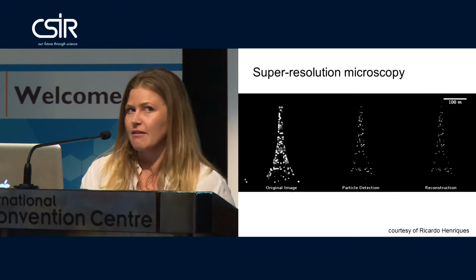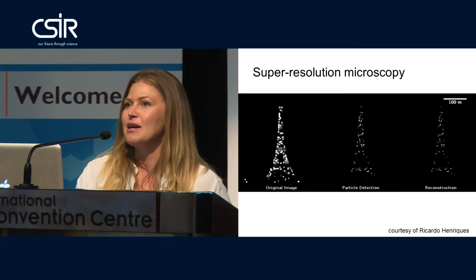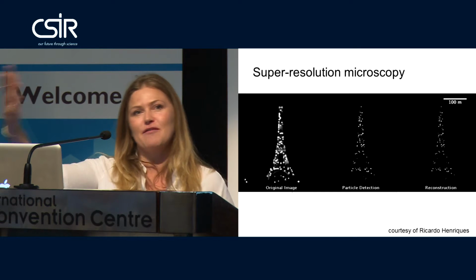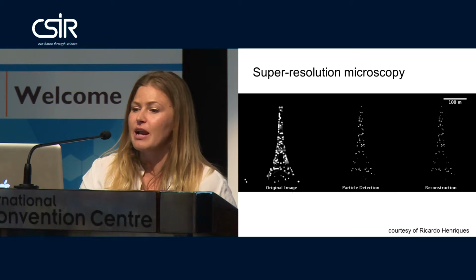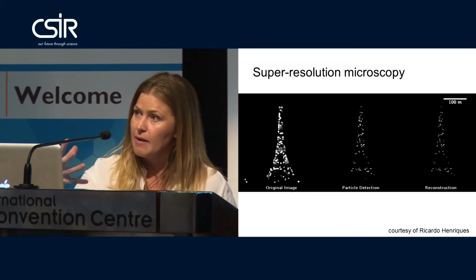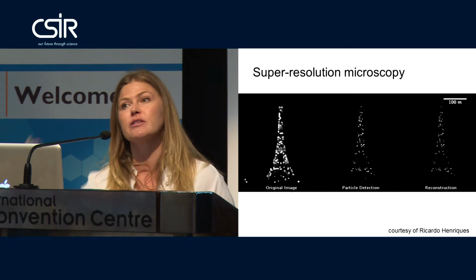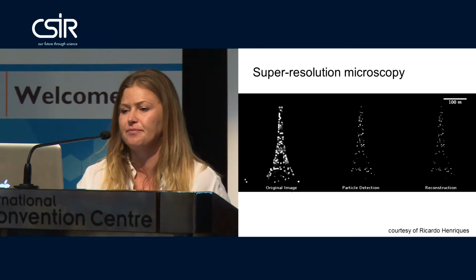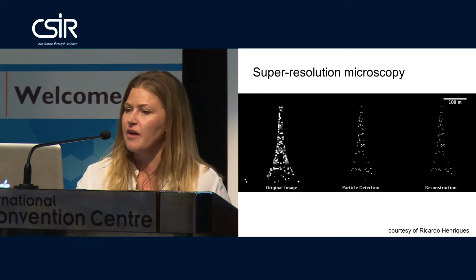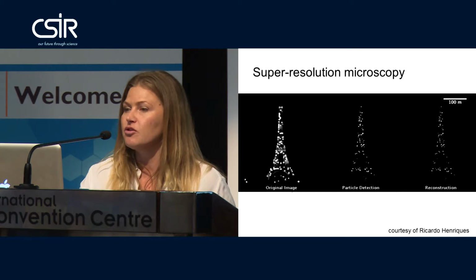And he'd been working on the microscope for hours and hours when he was based at Pasteur. He went to sit on the steps overlooking the Eiffel Tower, and he suddenly realized that this would be a classic way to show what we actually see under the microscope, what the camera is then pulling in, and what the algorithm then does to the reconstruction. So you're going to see the flashing lights of the Eiffel Tower, what the camera is then able to pinpoint, and what the reconstruction looks like.